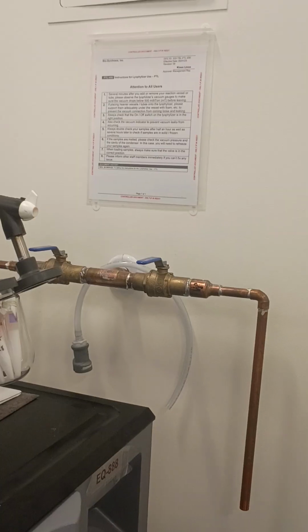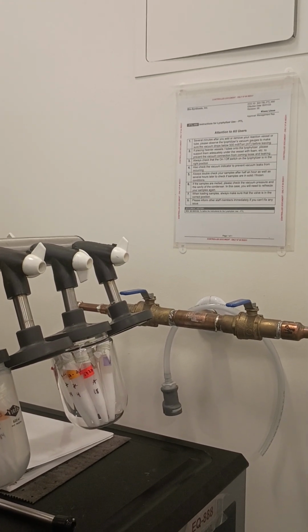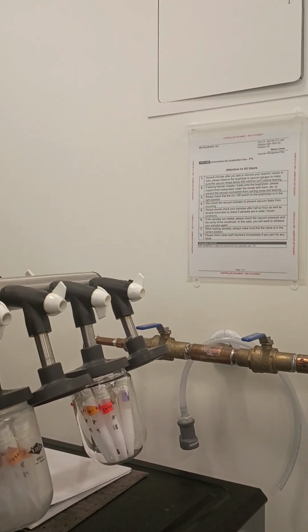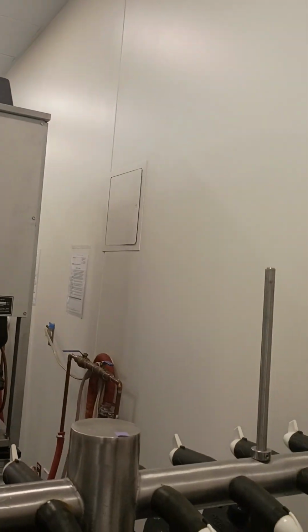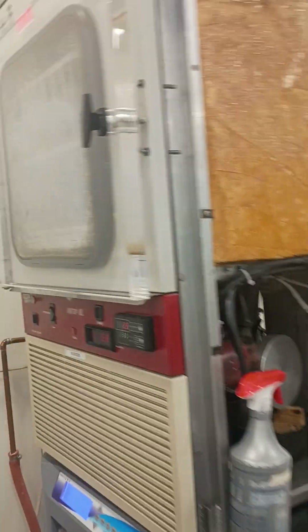This one runs on vacuum only, meaning it sucks all the moisture out to give you that powder, but only through the vacuum. That one uses heat. Let me show you. This one uses heat.